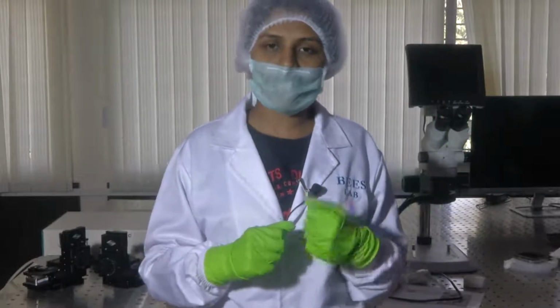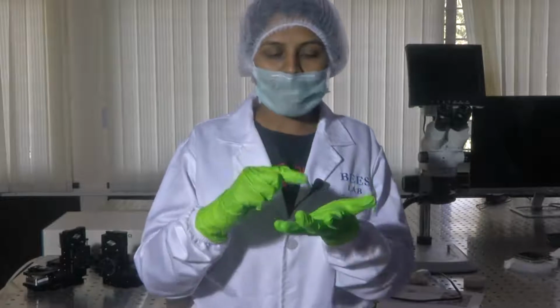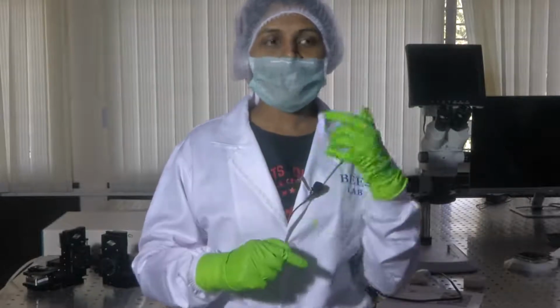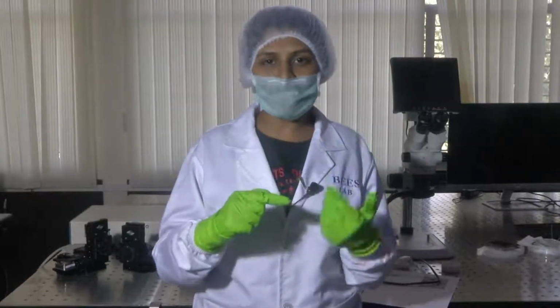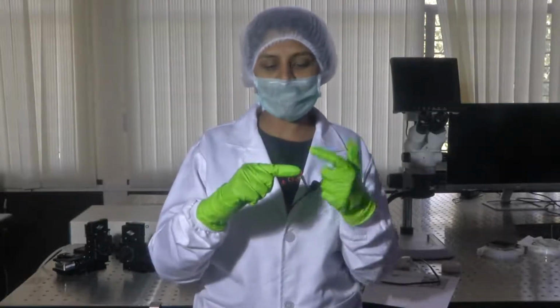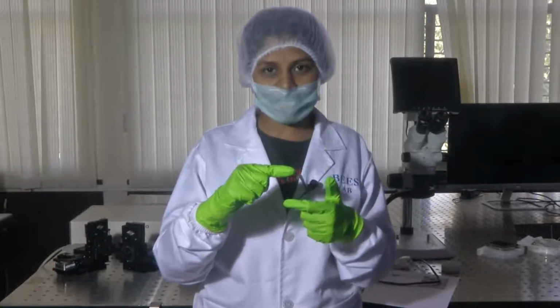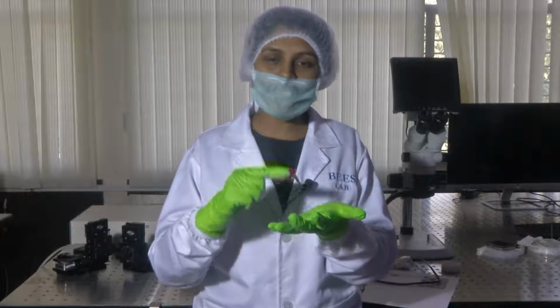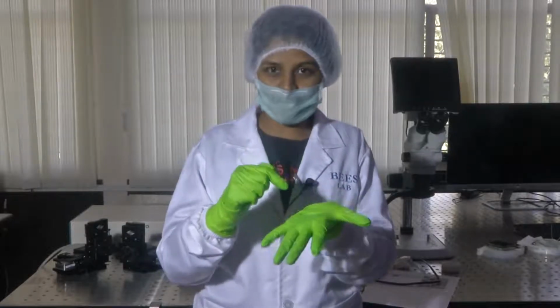In order to overcome the cumbersome optics used in AFM, you have strain sensors embedded on your cantilever. Professor Hardik would have explained in one of his research works where he used a cantilever with strain sensors embedded on it, and they tested the mechanical properties of breast tissues.